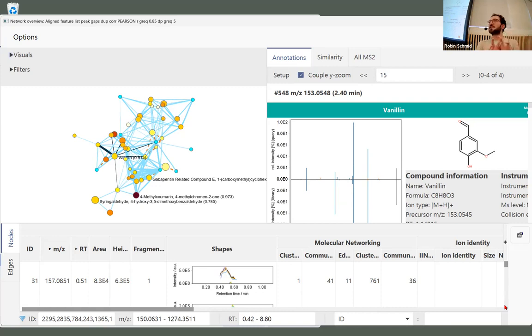Sometimes definitely with the feature list, when you sort it and do some things, sometimes it's good to just close the feature list. So you just X on the feature list and you just reopen it. Yeah, you just double click on the aligned feature list again, you reopen it. Sometimes it does things, you know. And maybe also for Mac, maybe control click for right click, but I don't know. Closing it. So, okay, closing and opening actually saved the day for some people at least.